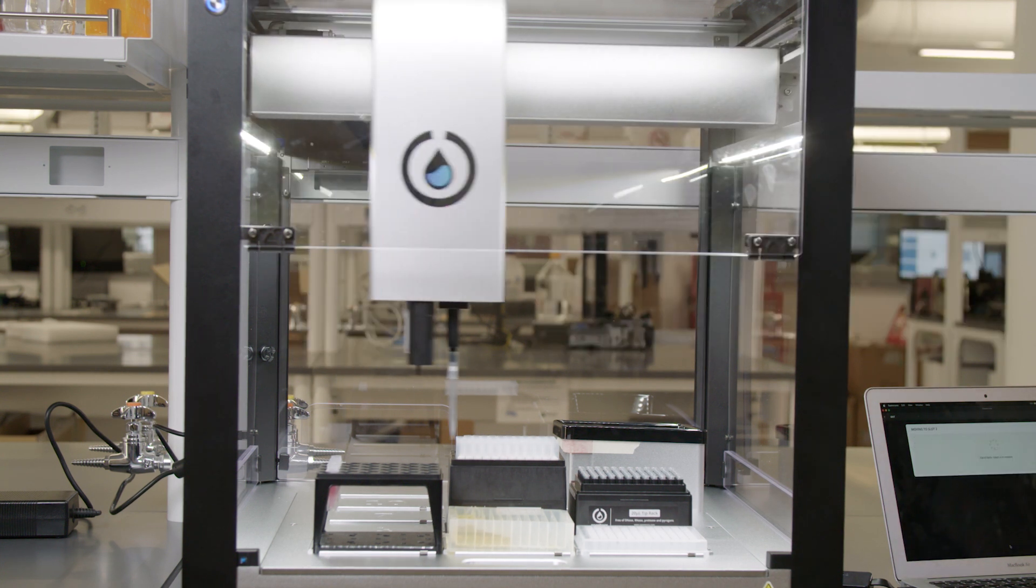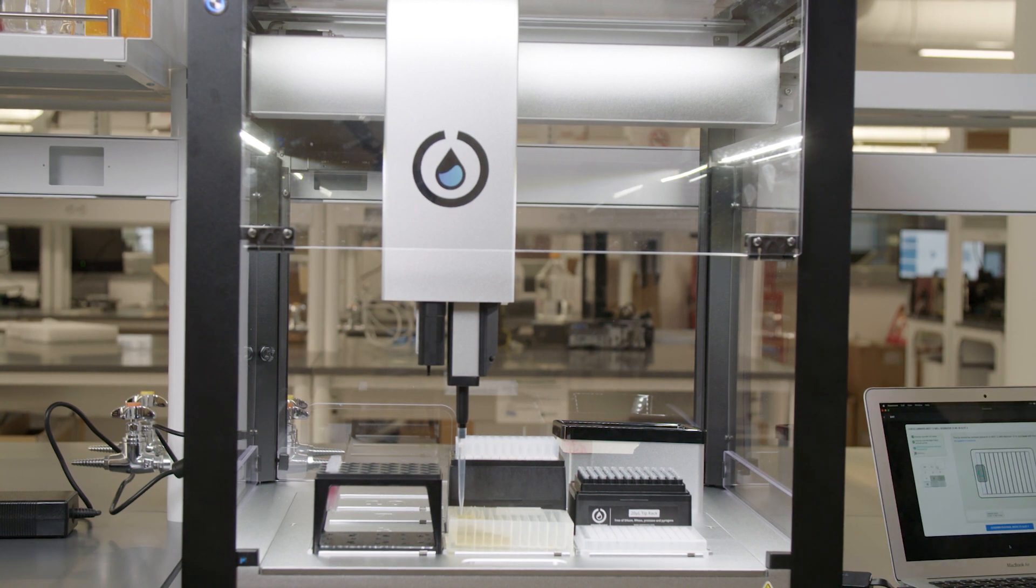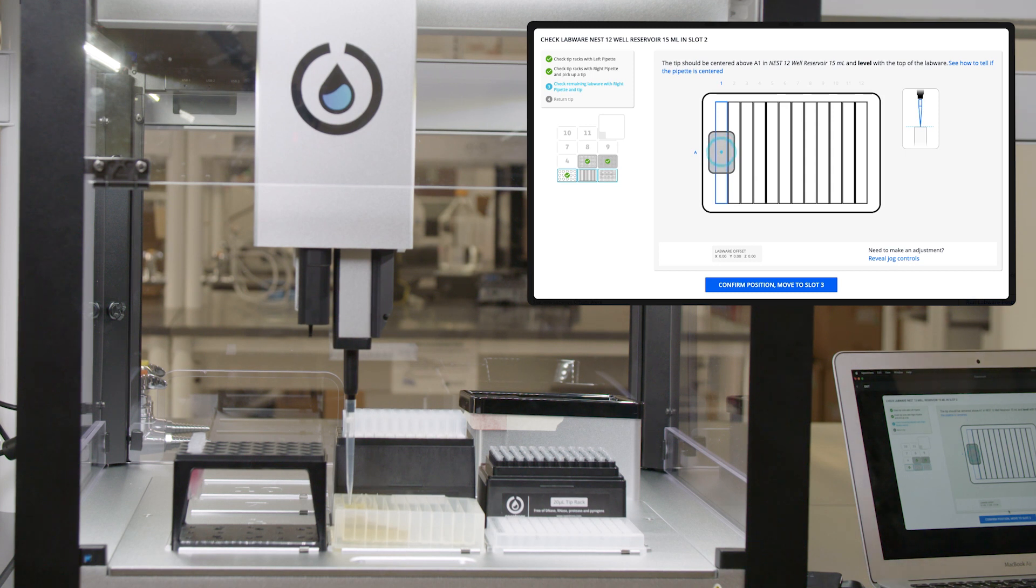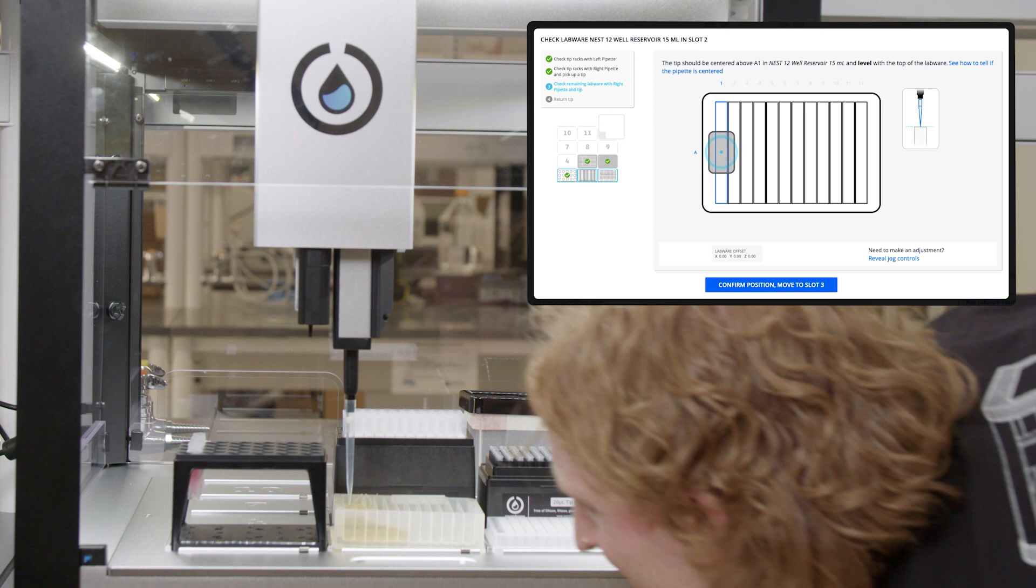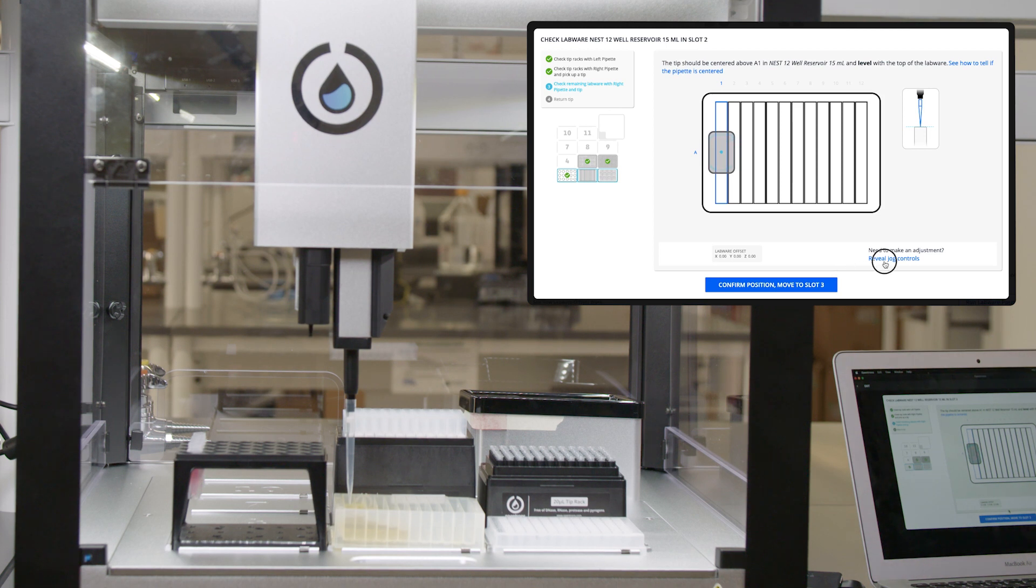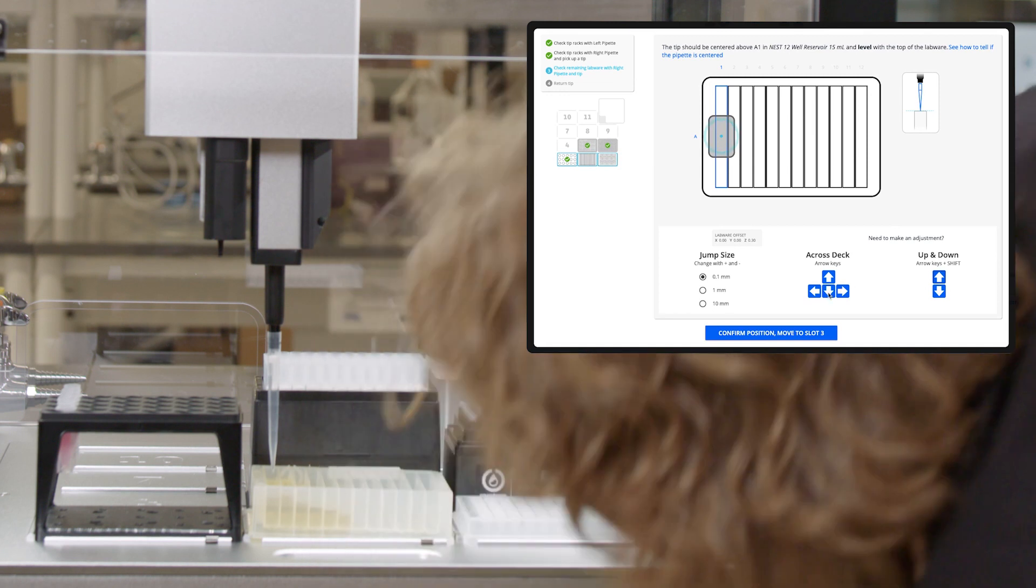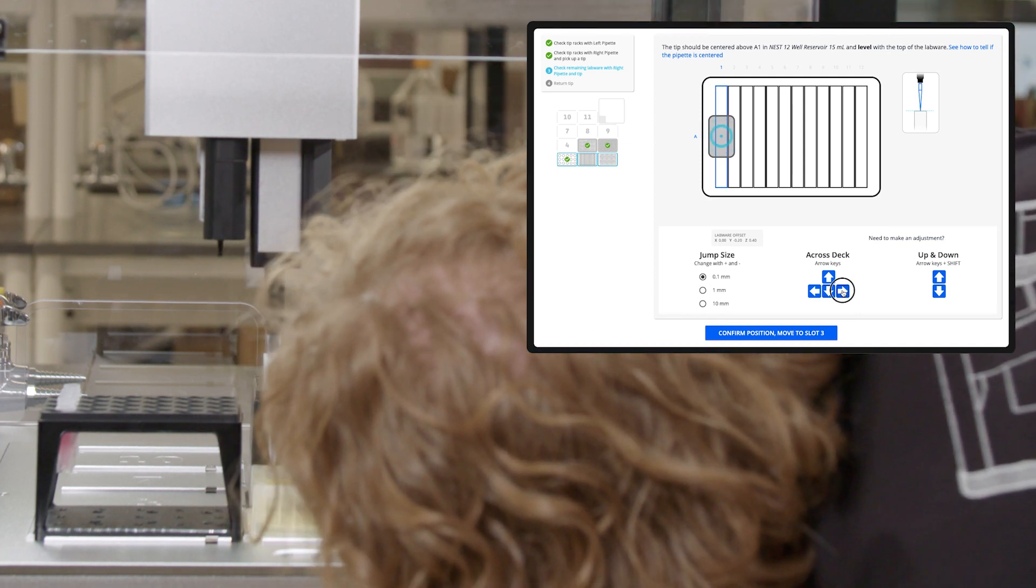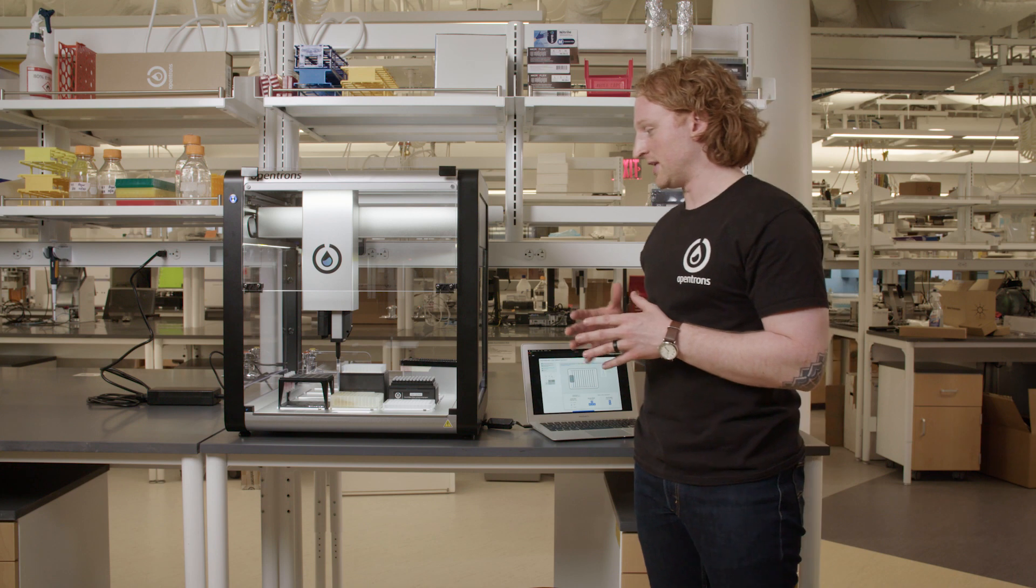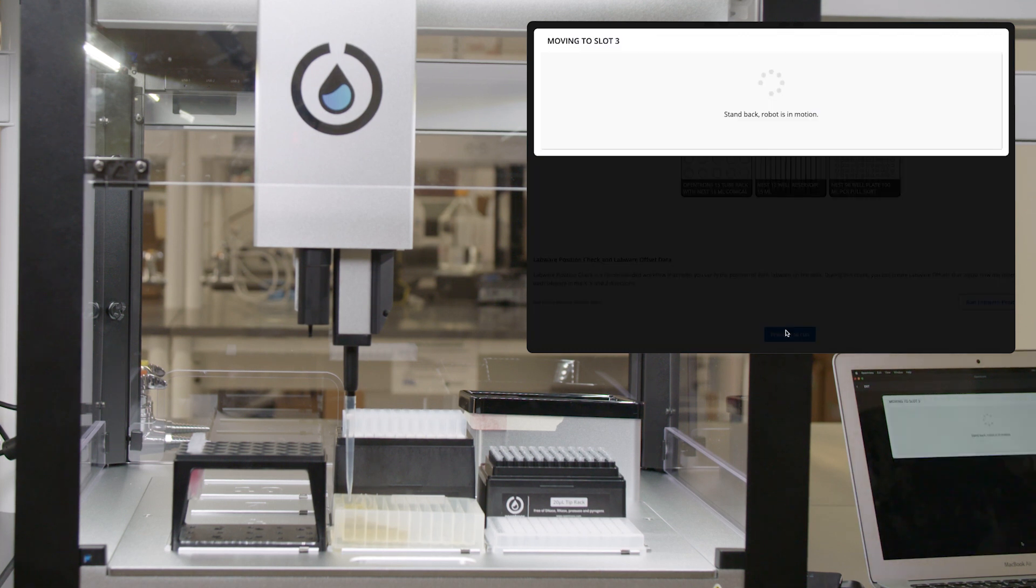And the pipette will move to slot two. So it's going to move to the first column in this reservoir. The pipette will move to well A1 in the labware in slot two, which is a reservoir, and I need to now center the tip in well A1 and make sure that the bottom of the tip is even with the top of the well. It is a little low, so I'm going to need to reveal jog controls and jog it up a bit. The tip is centered in well A1, and the bottom of the tip is even with the top of the well. So I will confirm position and move to slot three.